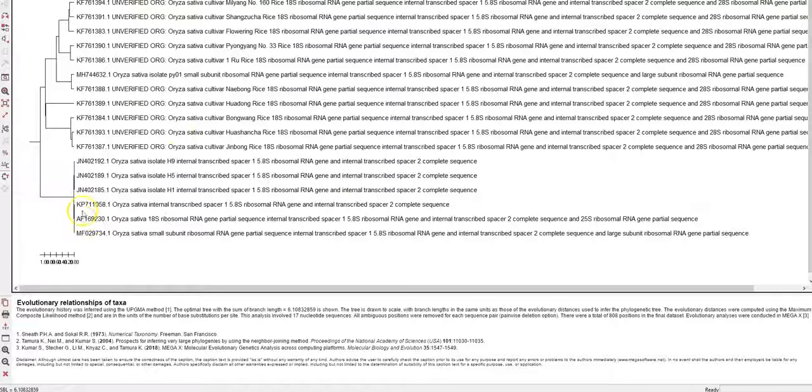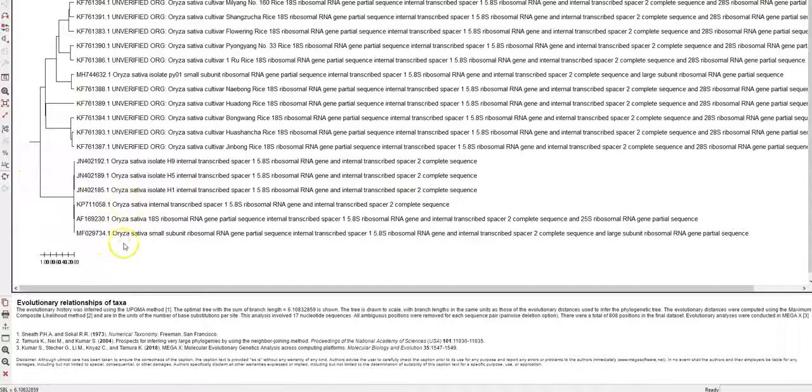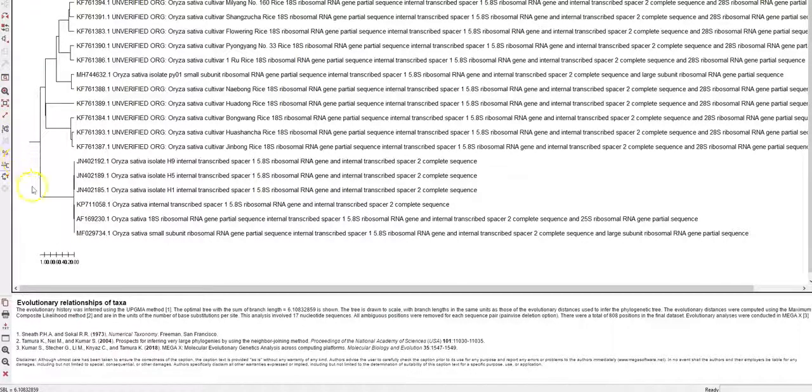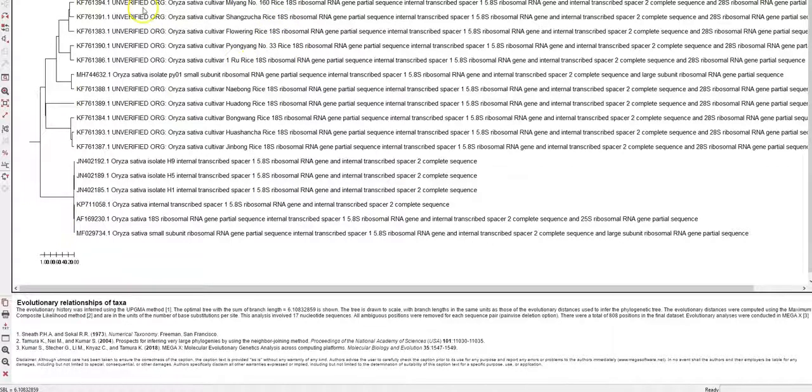You can see the distribution of the various sequences and their clustering based on their sequence homology or the sequence similarity. This is a very useful software for the analysis of sequence data.